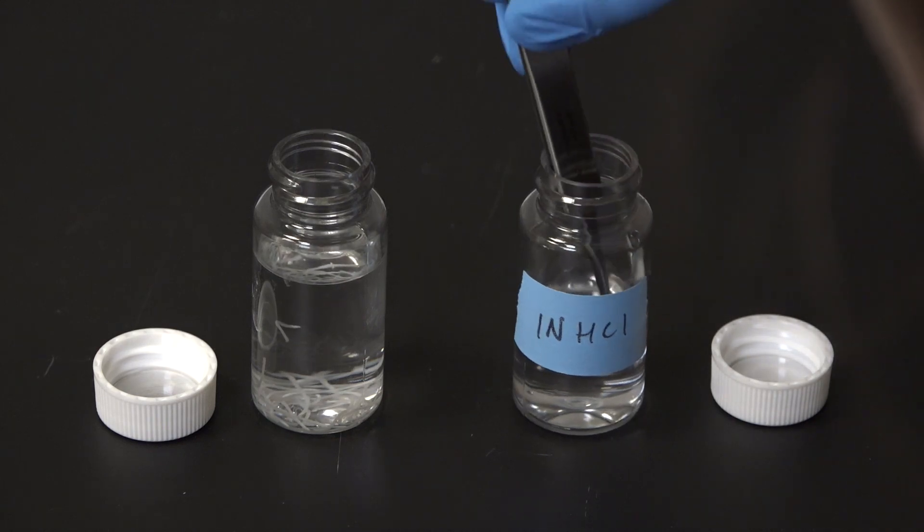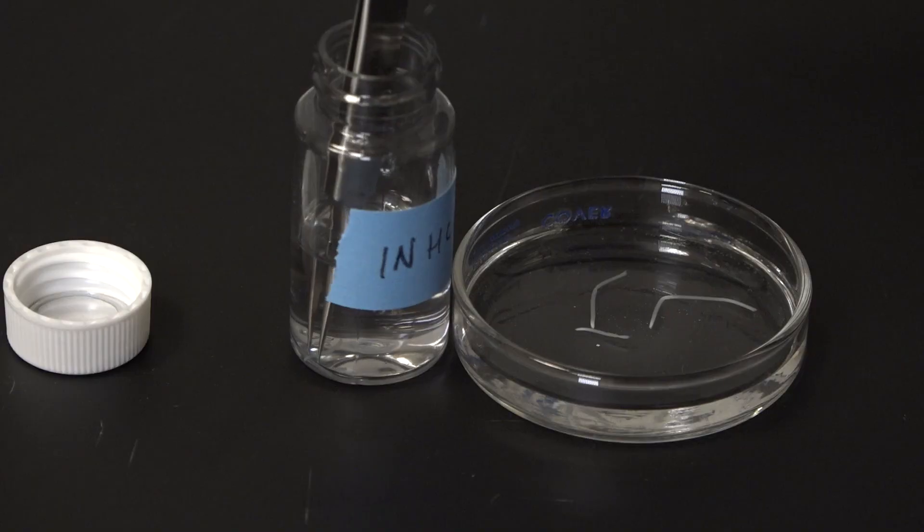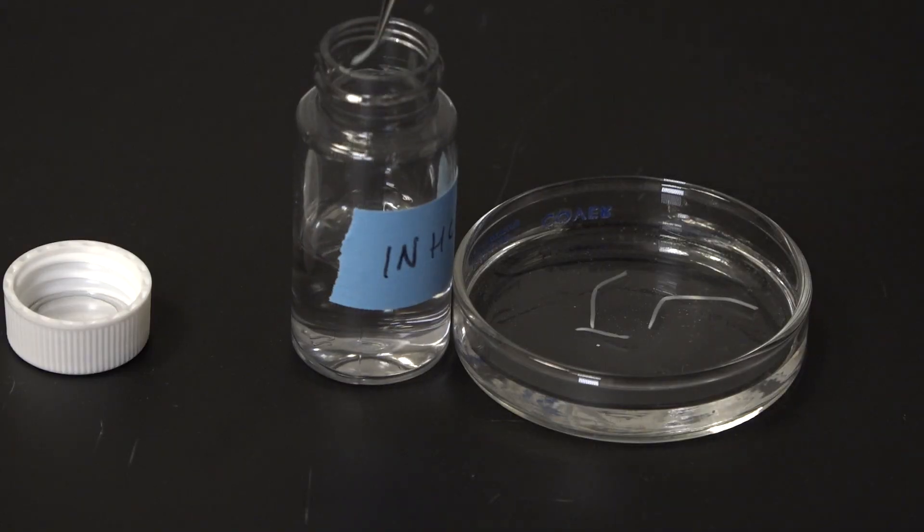Next, I'll move them to the dish of water for a quick rinse.